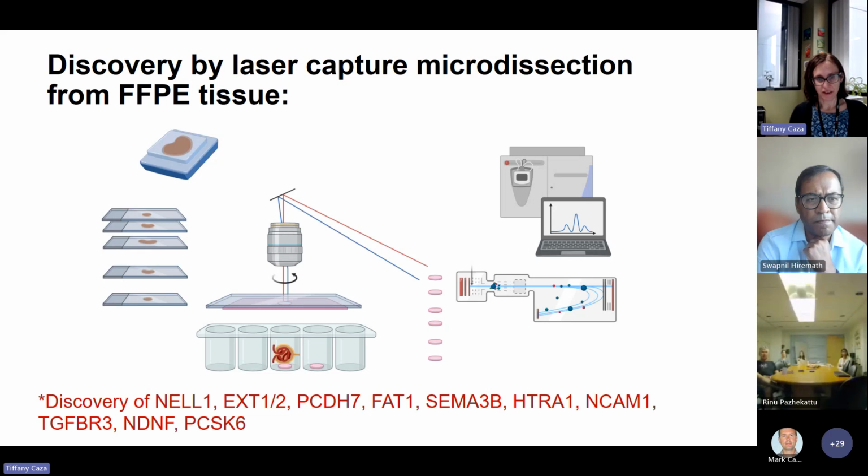So we take residual kidney biopsy tissue and take these thick, well, 10 micron sections, and you put them onto these membrane slides, and then cut glomeruli out with a laser, do trypsin digestion into peptides, and then run liquid chromatography and mass spectrometry. This will enrich for your target of interest by at least 50-fold, as you're getting rid of the effect of the tubulointerstitium and such.